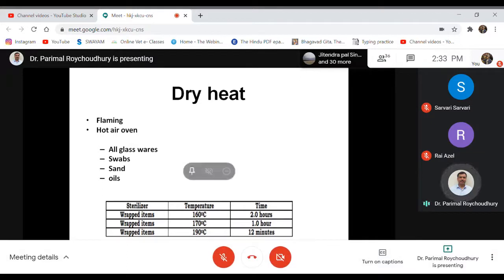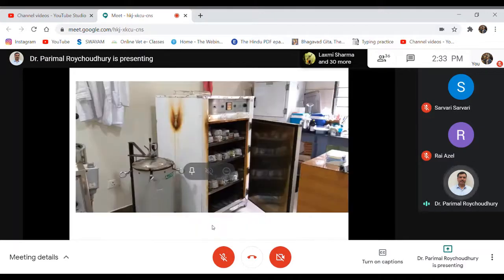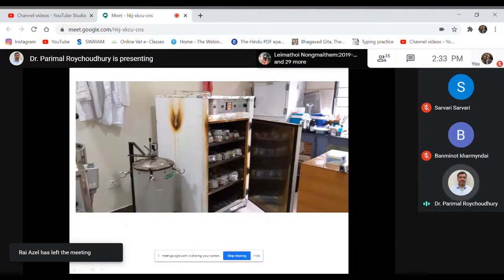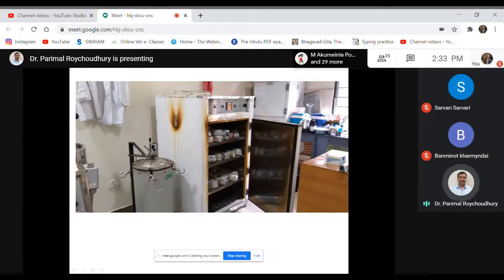Okay, so this is the hot air oven method of sterilization. At higher temperature, sometimes the wrapping paper may burn off, and as you see, sometimes a high temperature was set and some burning was there. So to be in a safe position, we need to set it at 160 degrees, and we have to maintain 2 hours once the inside temperature is 160.